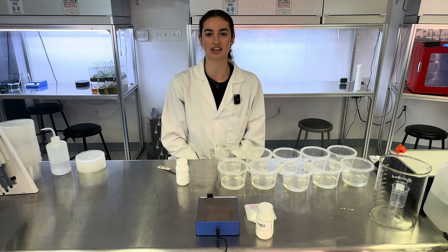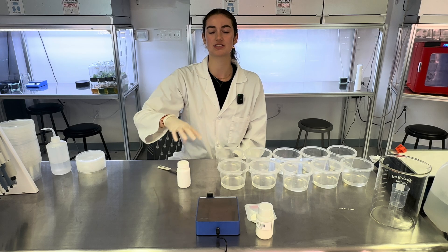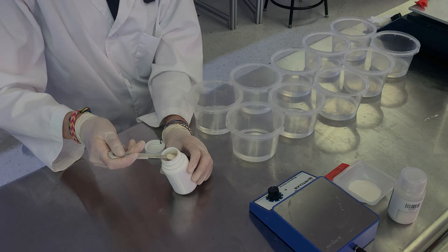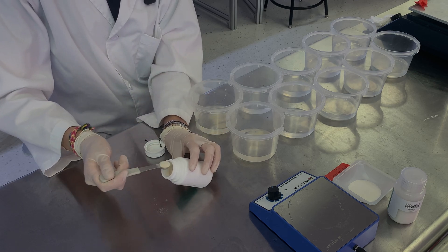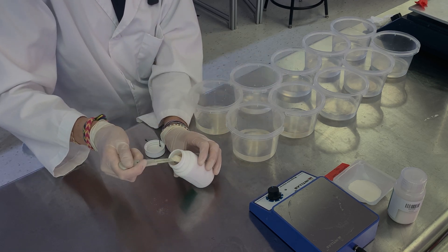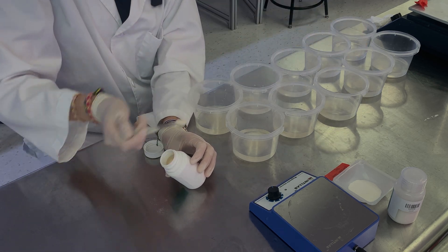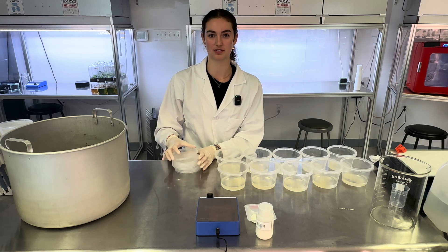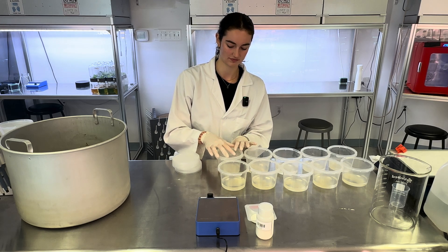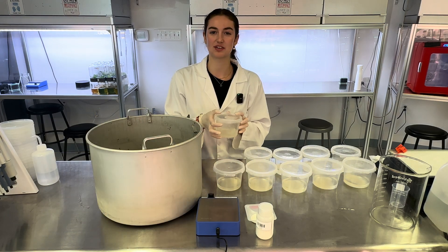Now it is time to add our gelling agent, so I'll add one-fourth teaspoon of agar into each container, which is the equivalent of 8 grams per liter. Now I'll put on our lids, but make sure not to fully close the containers. Now they are ready to put in our pressure cooker.